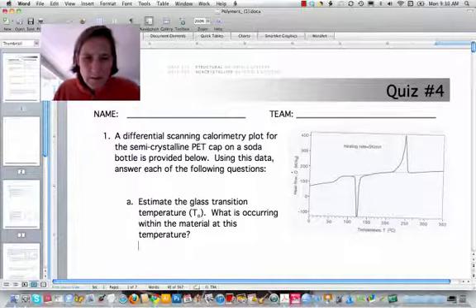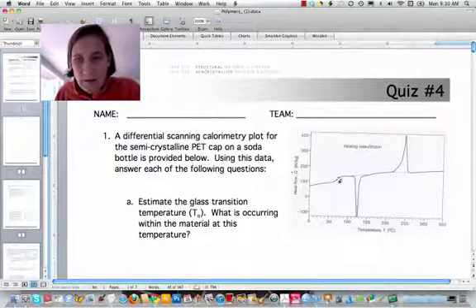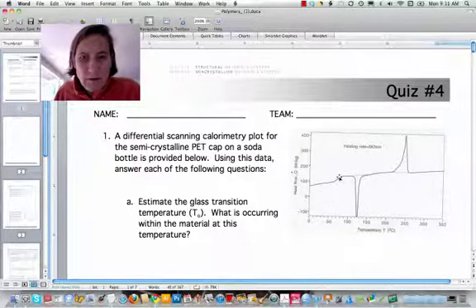So how that glass transition temperature shows up in a DSC output is right here at this little hill that essentially is a change in the heat capacity. So there's more heat that is required in order to keep the temperature of the sample and the reference equivalent.